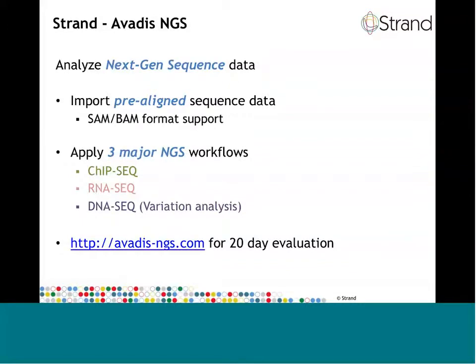Avadis NGS supports the three major NGS workflows: ChIP-Seq, RNA-Seq, and DNA variant analysis or DNA-Seq. In the next few minutes, I will discuss each of these three major workflows in more detail.